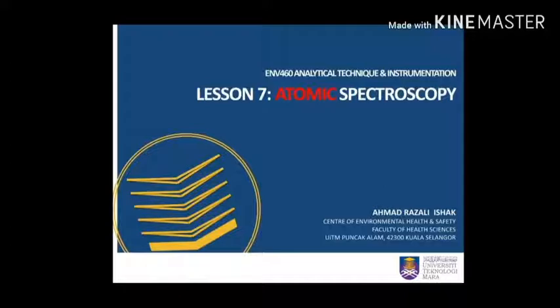Today we will proceed to lesson 7, atomic spectroscopy. In the first 6 lectures, we already covered the sampling and sample preparation methods for organic and inorganic compounds. Starting from lesson 7 until 10, we will proceed with instrumentation analysis. This time, we will look at atomic spectroscopy.